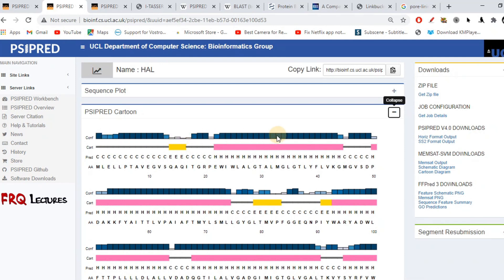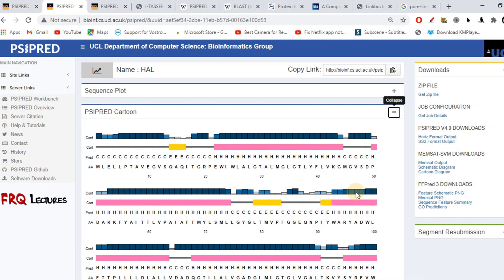The bars represent the confidence score. If the height of the bar is greater and the confidence score is close to nine, eight, or seven, that prediction is acceptable, reliable, and quite accurate. If the peak is lower — some are even zero — that means the section is predicted but may not be accurate. The greater the height of these bars, the more reliable the prediction.